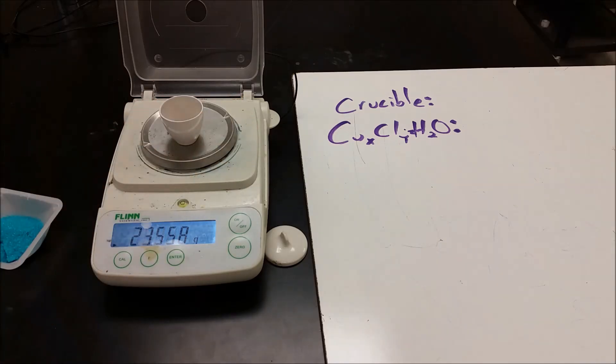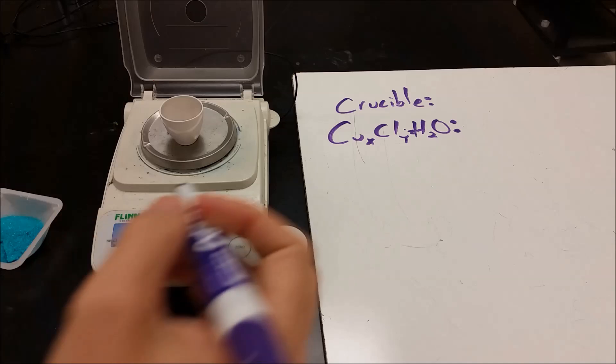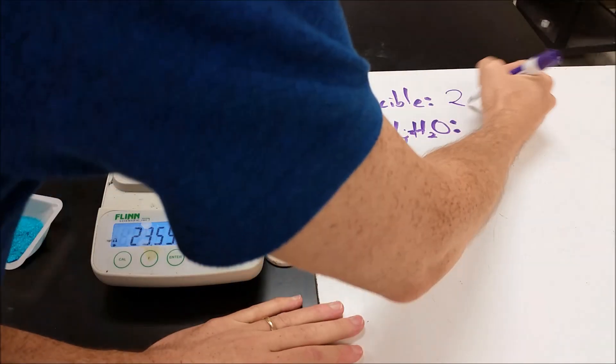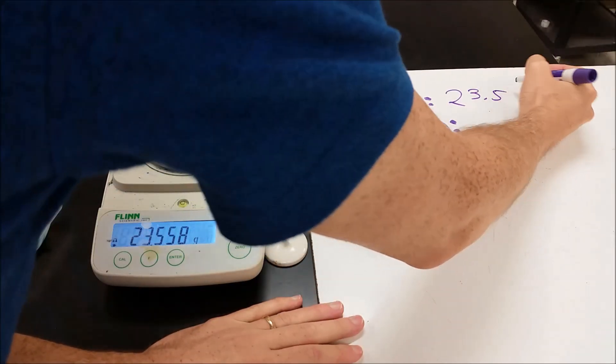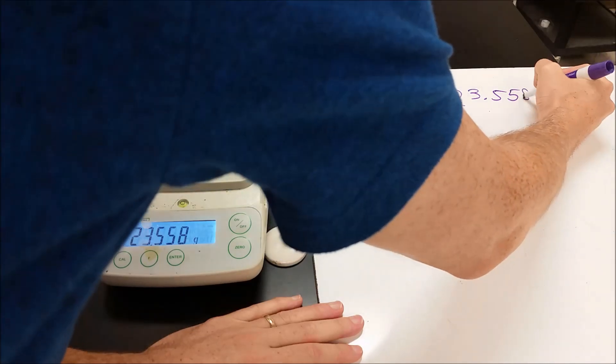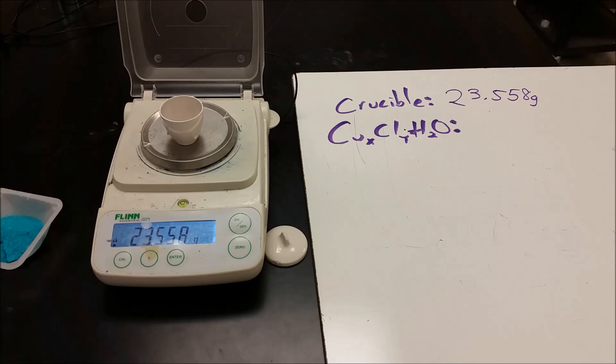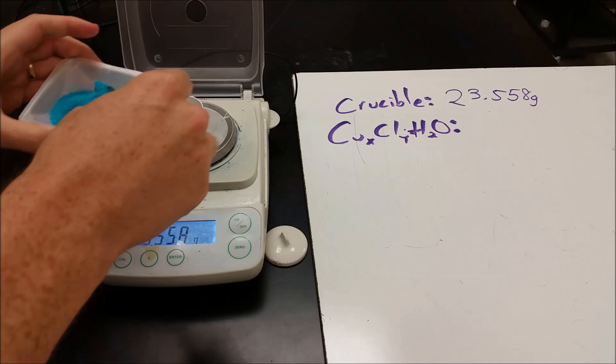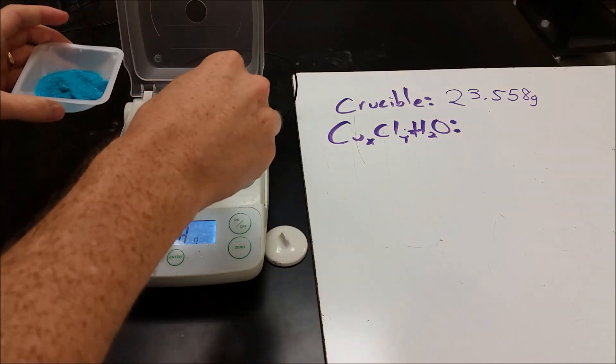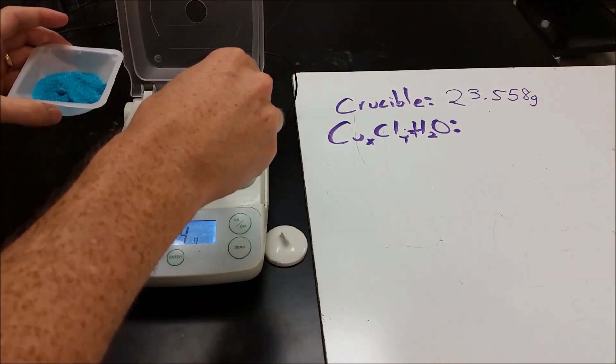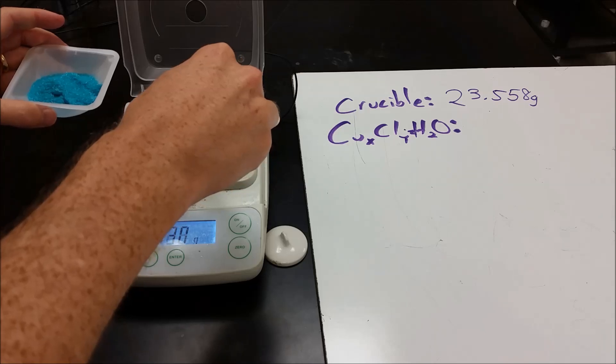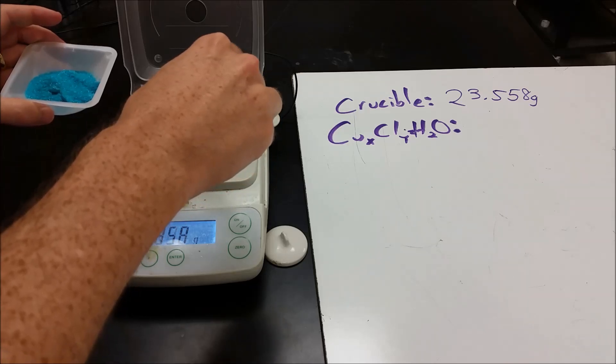So our empty crucible, and then we're going to add in our mystery copper chloride hydrate until we get at least a gram.